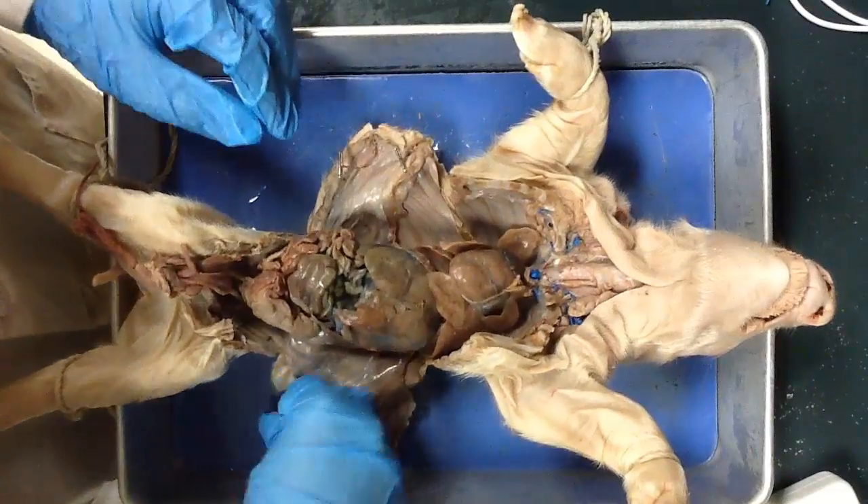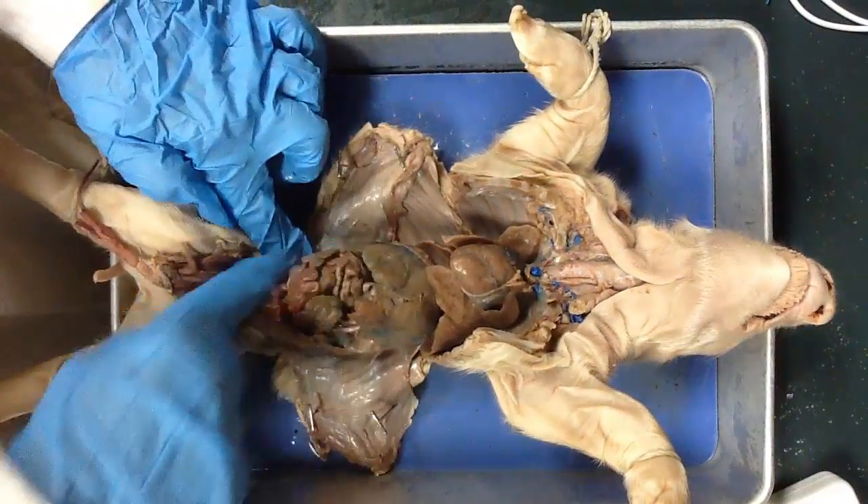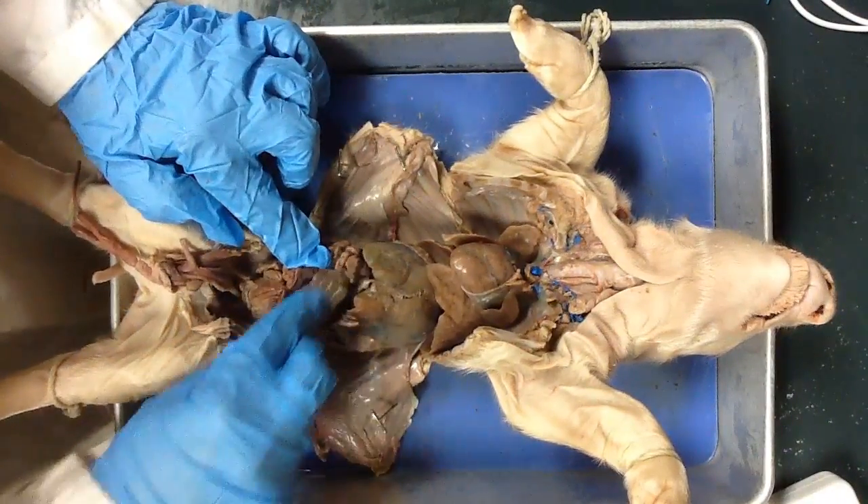Moving right along, some things that you've already identified: the small intestine here and the large intestine here.